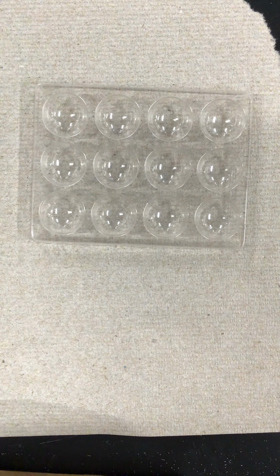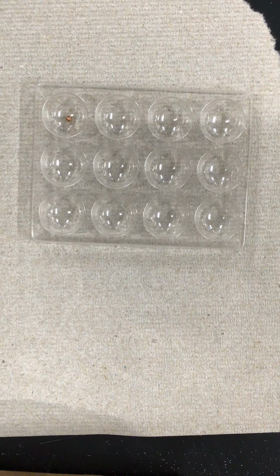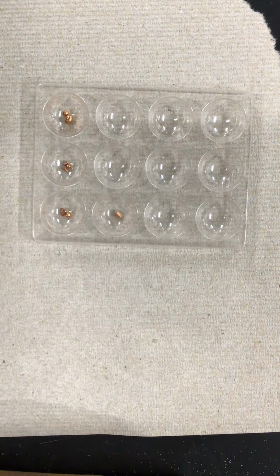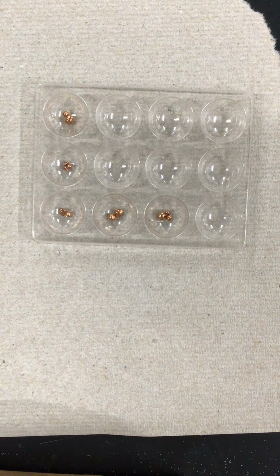Again, the question that we're trying to answer is which metal is the most reactive, all right? And so we're going to react it with our same 5 solutions. I'm going to put a couple pieces of copper shot into each of our reaction wells. What we're looking for is evidence that a chemical reaction has taken place: unexpected color change, gases, changes in energy, all of that stuff.